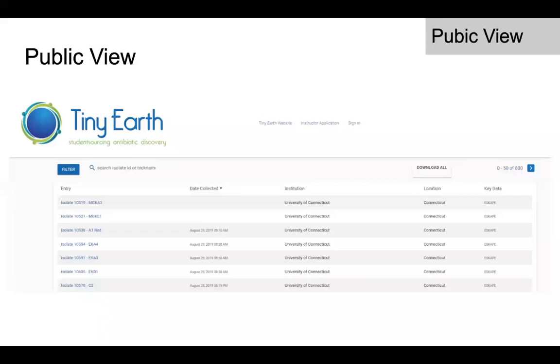Here in the web interface, we see a limited amount of information. This is something that we're working on improving, so you do have those two options. One, the filter, where you can narrow down the isolates that way, or you can download into Excel and start doing some sorting as you're familiar with Excel.